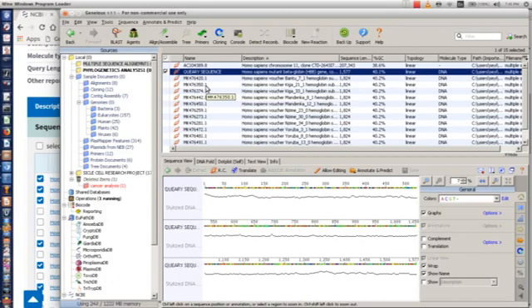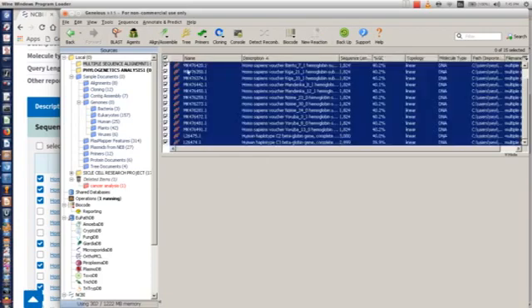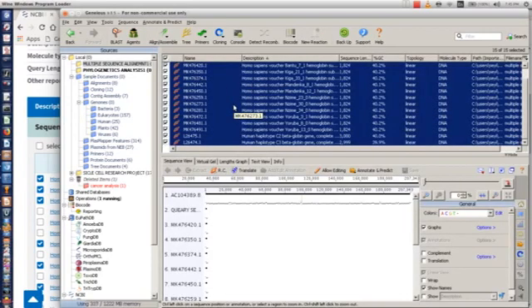Yeah. So now remember, we are working on multiple sequence alignment. A multiple sequence alignment is aligning sequences that are more than two. Are you getting it now? So all you need to do is pick all the sequences you downloaded here, because we want to run the multiple sequence alignment of these sequences. Now you just click here and double click, so everything will be picked. As you can see, everything is picked here.